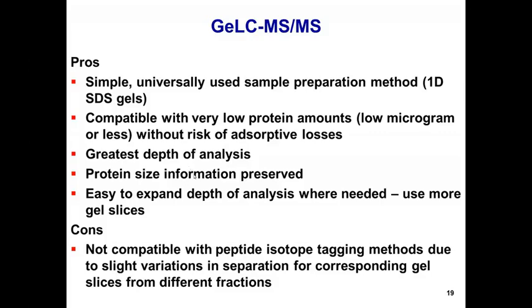And the disadvantage is that it is not particularly compatible with peptide isotope labeling methods due to slight variations in separation from one gel slice to another.